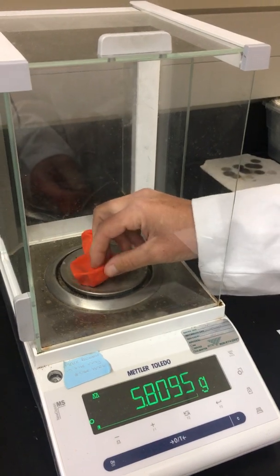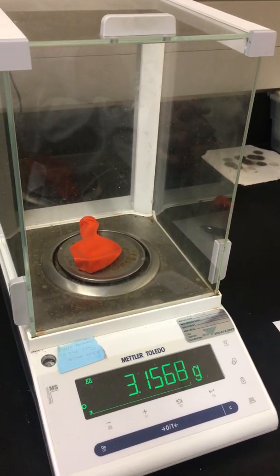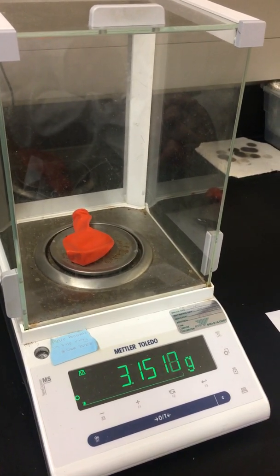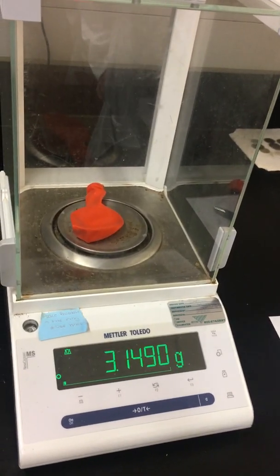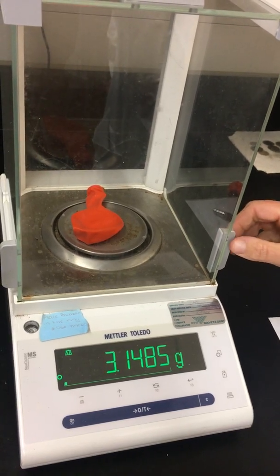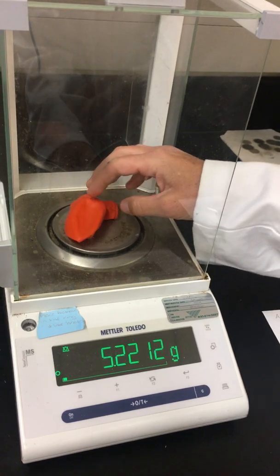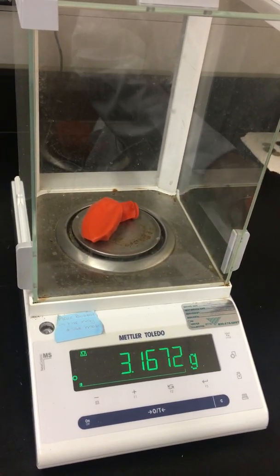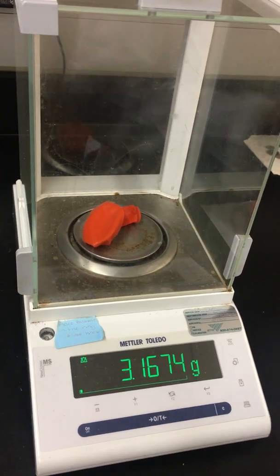There we go. It's important to have the balloon on the balance. The reading is 3.1674 grams.